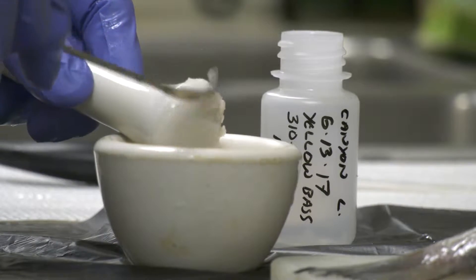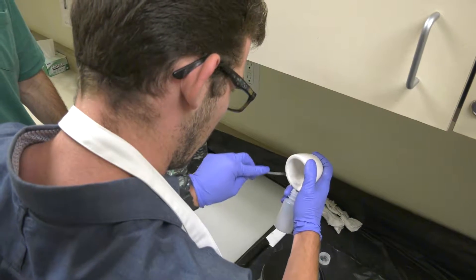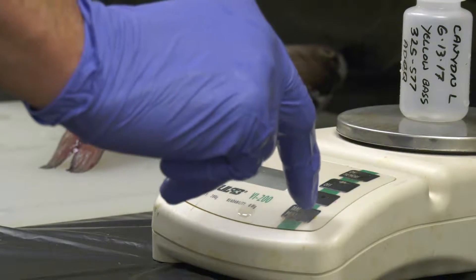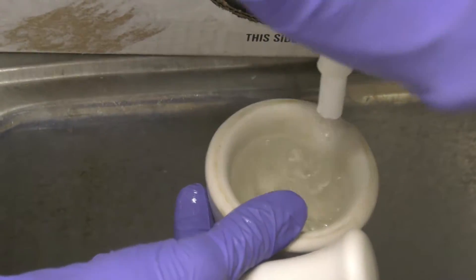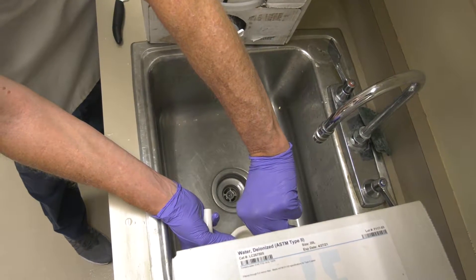Once we have those ground up pretty well, we make sure we have all the tissue back down into the mortar. Then we go ahead and take the actual sample and transfer it to the bottle. We need to do this well so that we don't contaminate the fish any further, so we get really good data at the other end. The mortar and pestle, the knife, etc. all get acid washed with 10% hydrochloric acid, then rinsed with DI water.